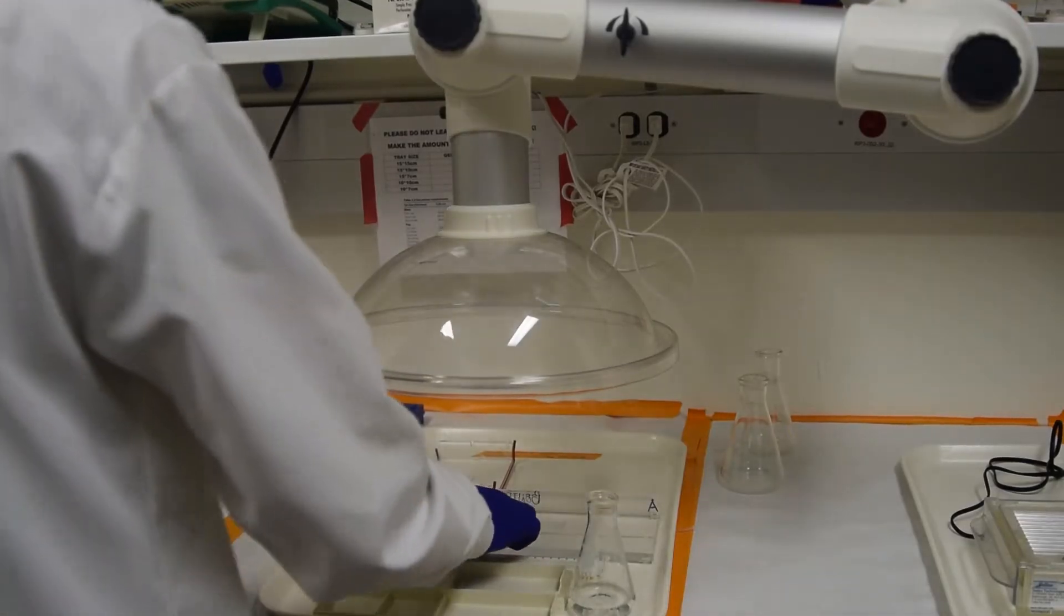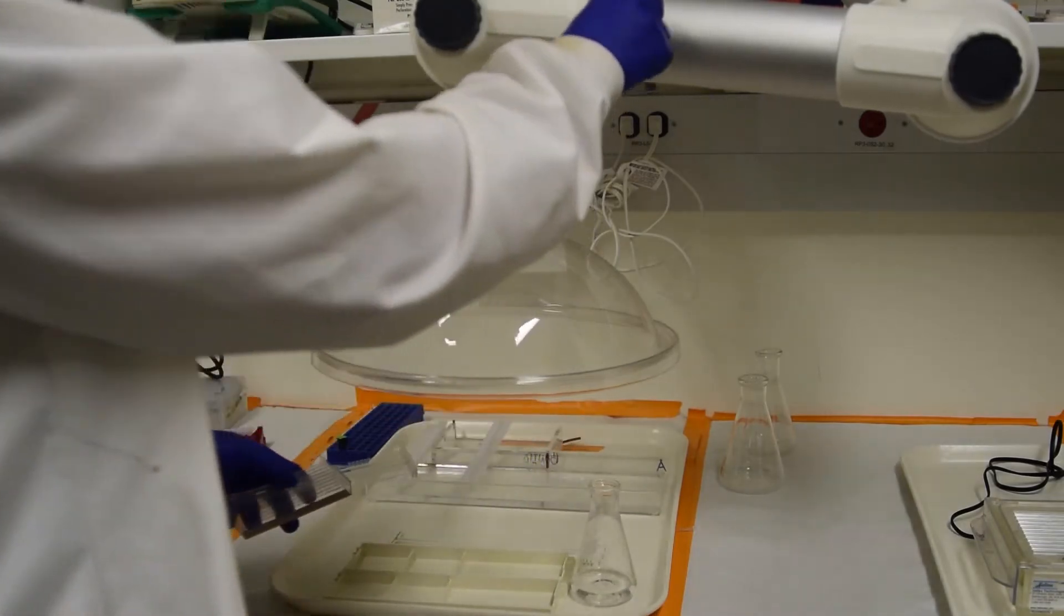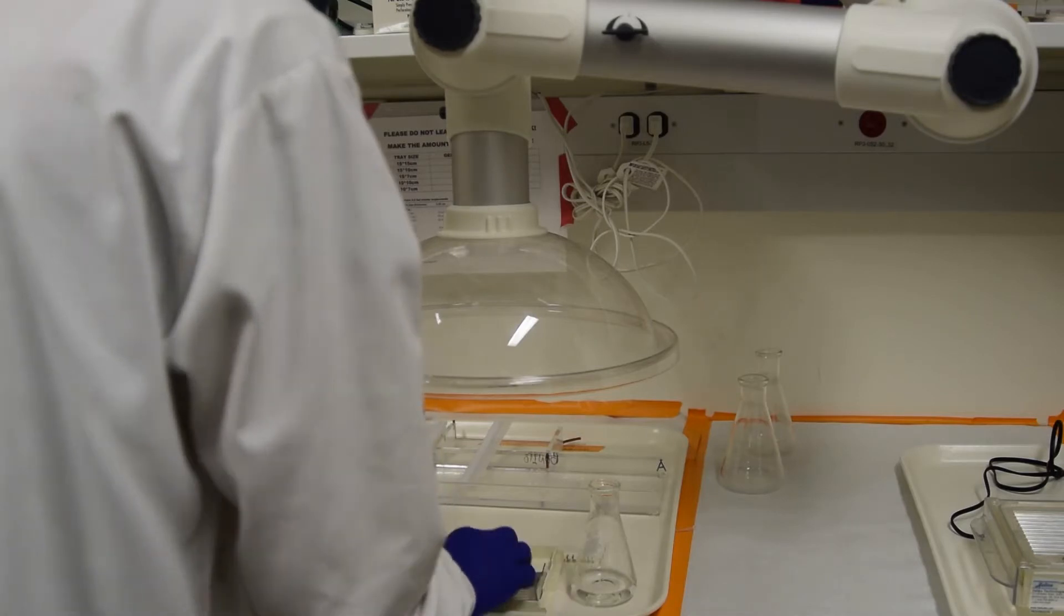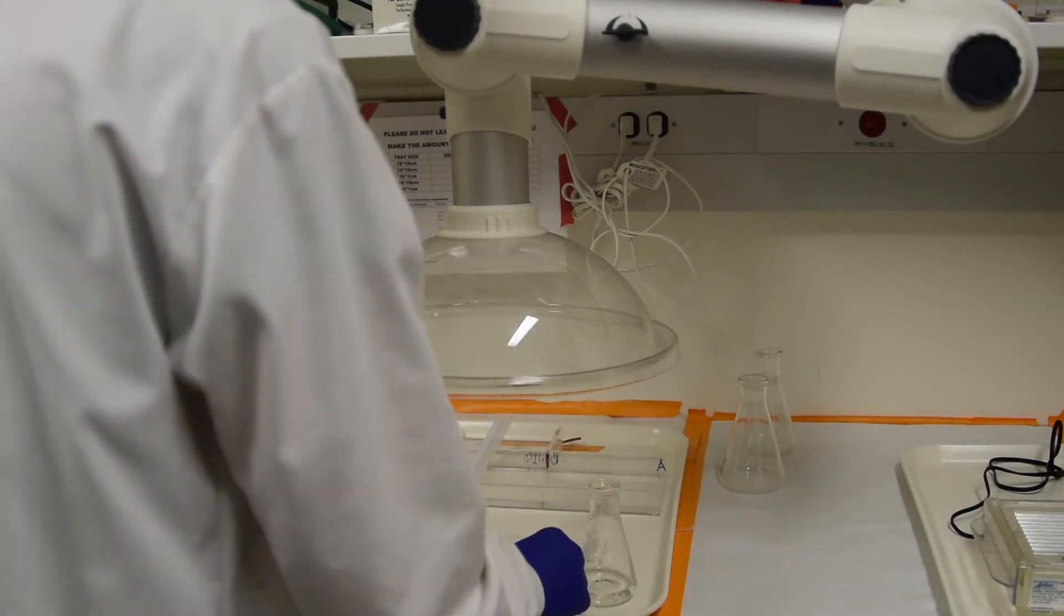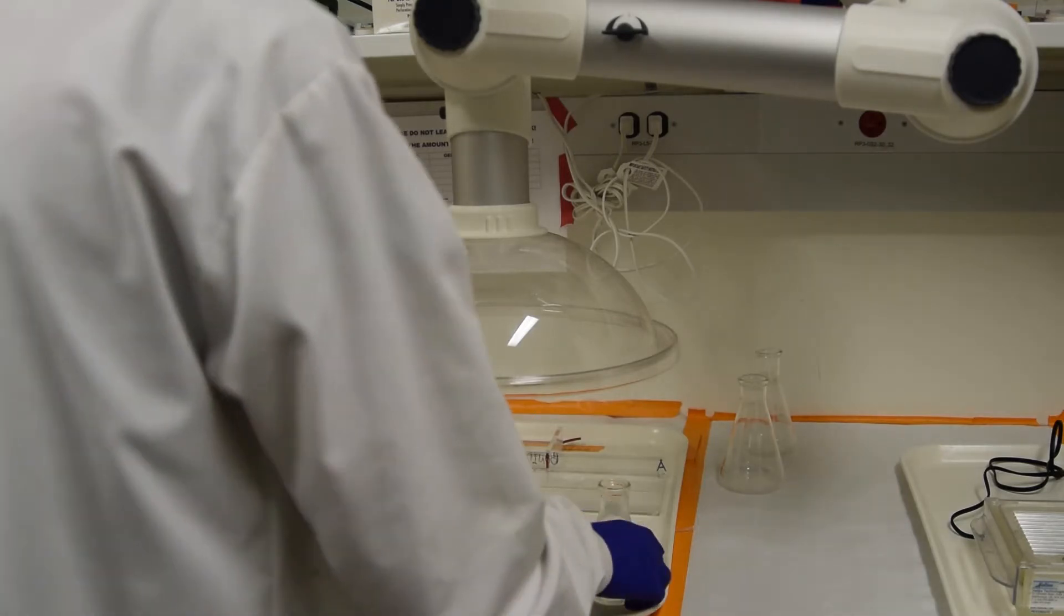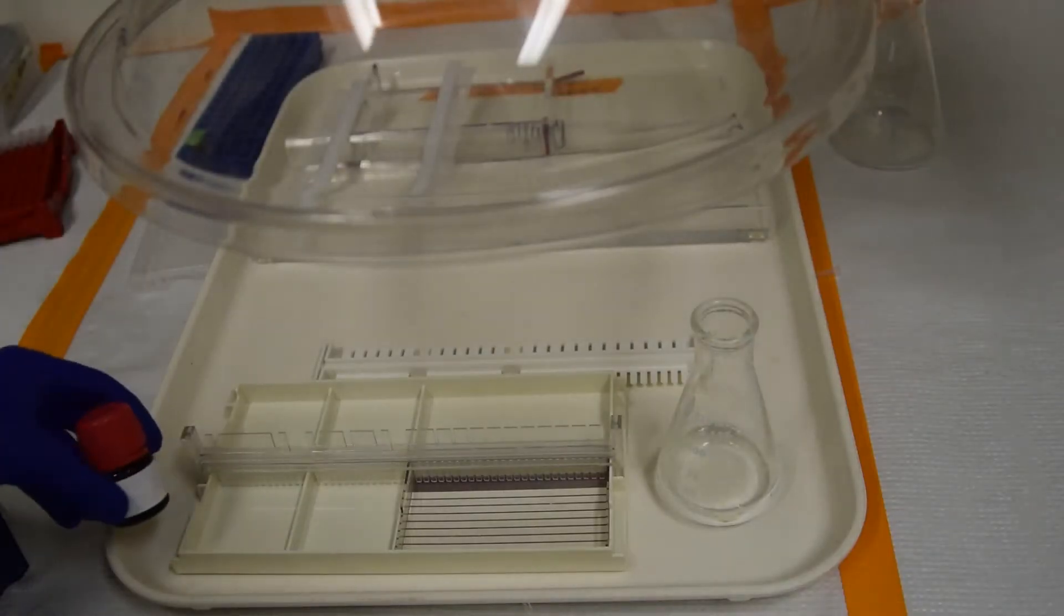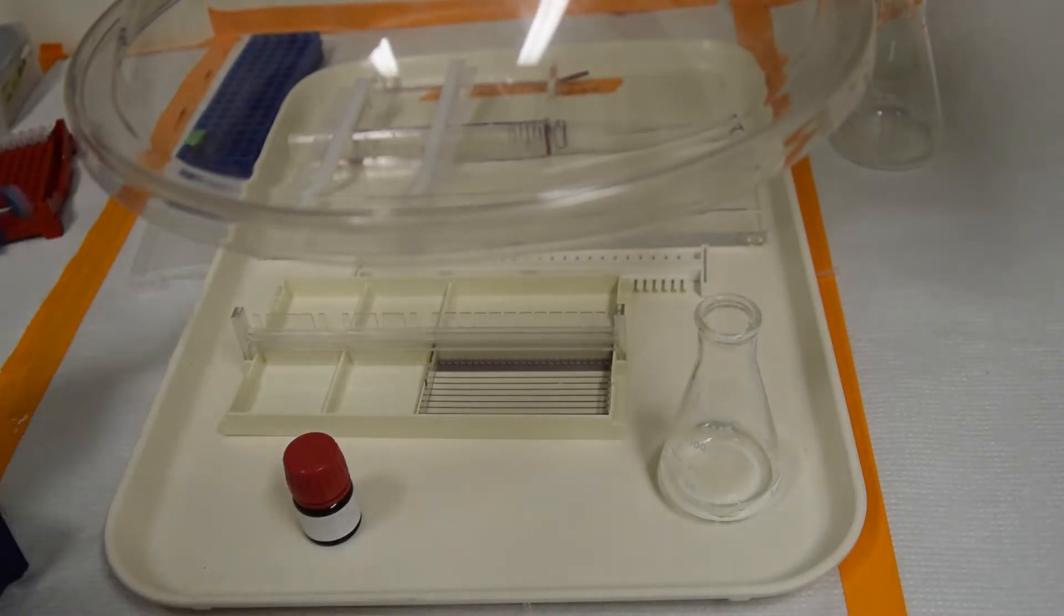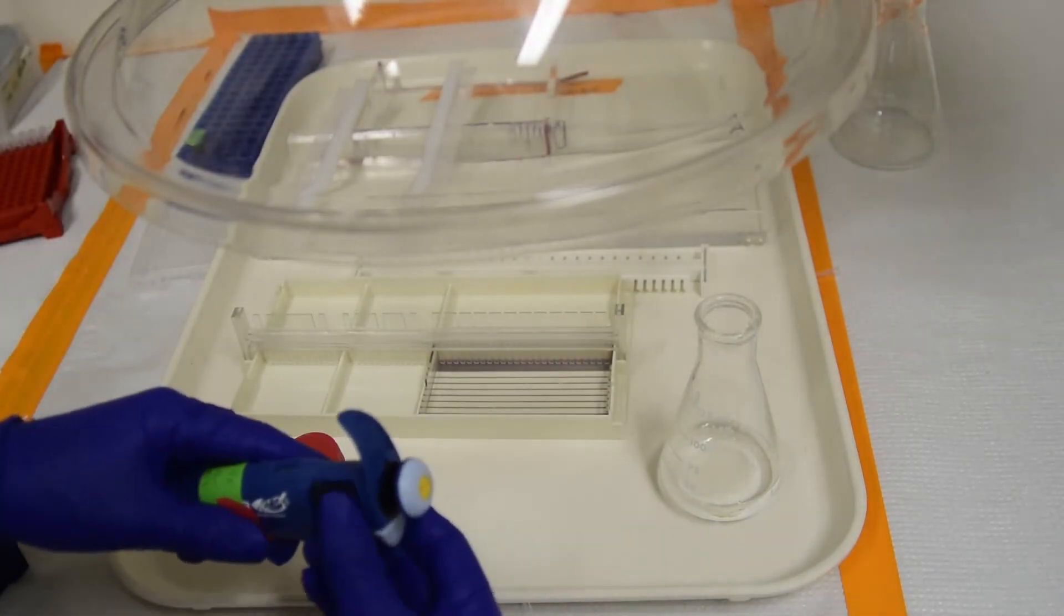Turn on the vent. Get the ethidium bromide off the shelf. We use 2.5 microliters per 100 milliliters of gel.